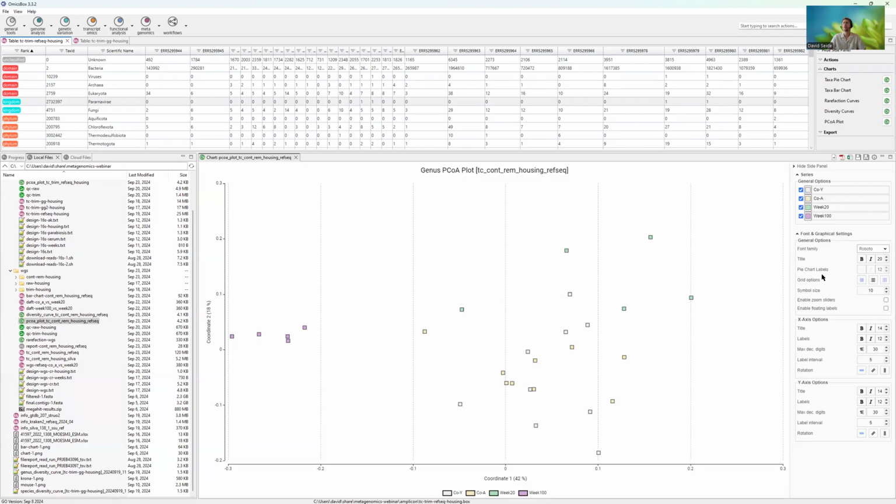It has some effects at the taxonomic composition level. I can change colors. I can make this, for example, green, and now I cannot distinguish it anymore from the 20 week. So this helps you to cluster stuff, to see how they separate, and to compare with your hypothesis. That's very handy.